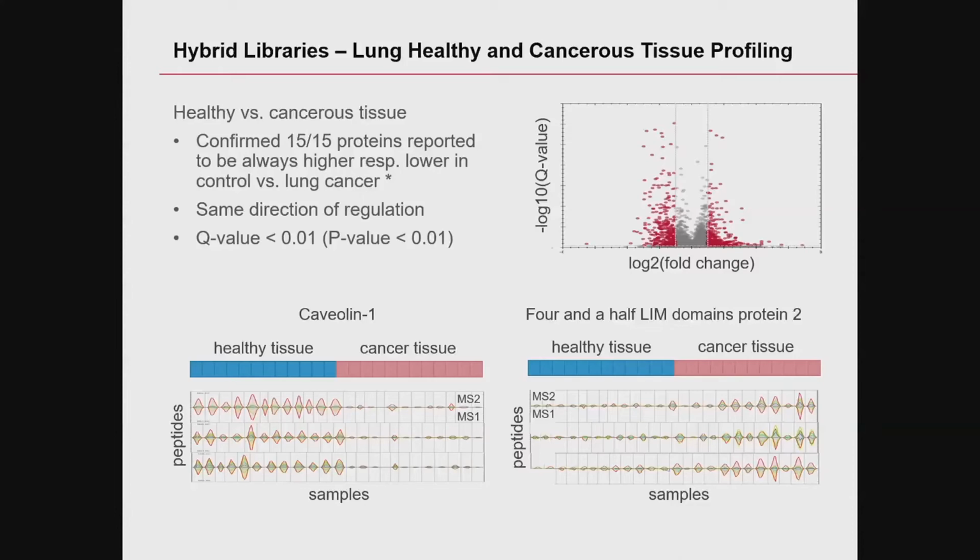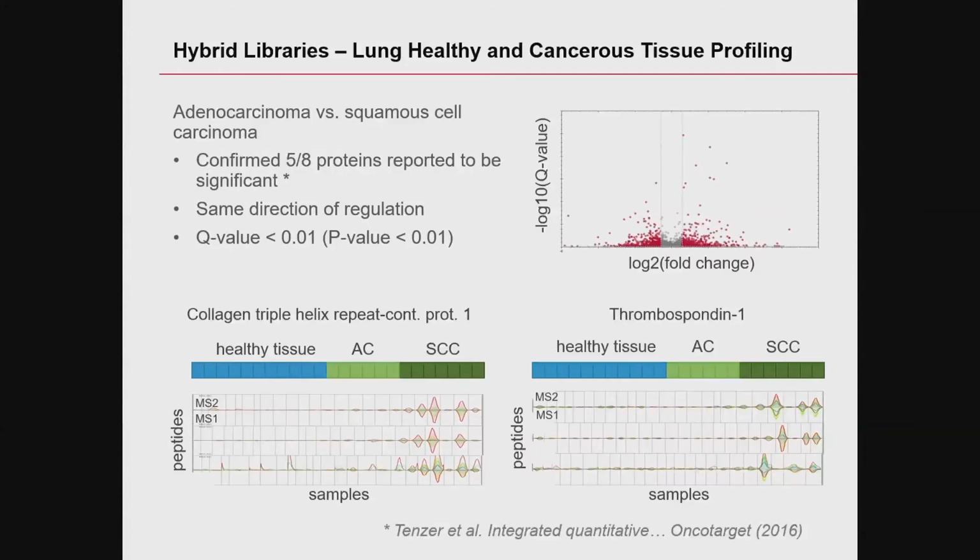Again, here I did this analysis before using the project-specific library. But these data here, they look essentially the same. So it's really high quality results you get. We can also cross-compare this to published data and we get exactly the same. It's actually shown on this slide here.